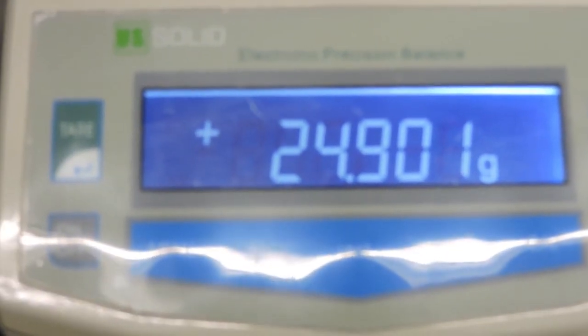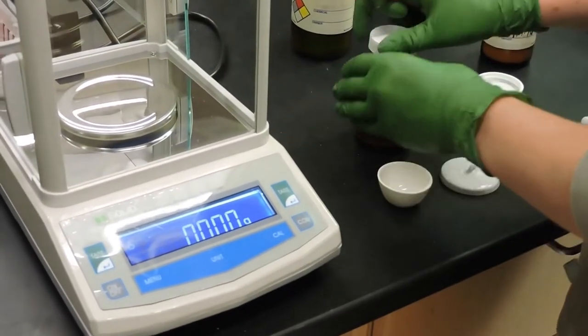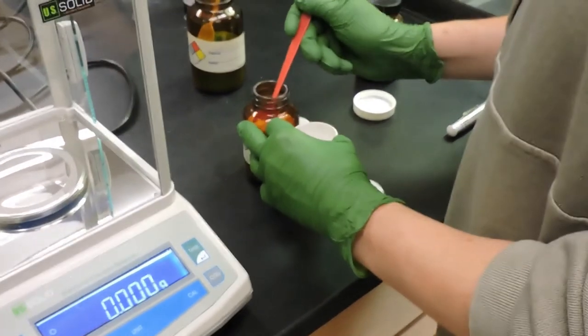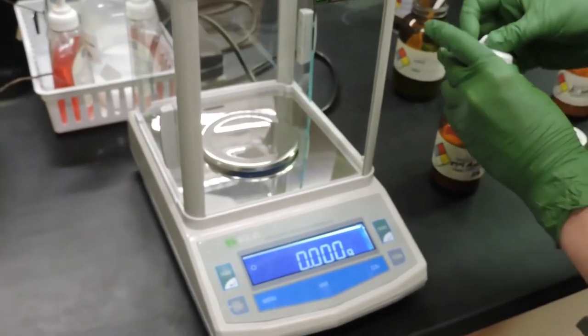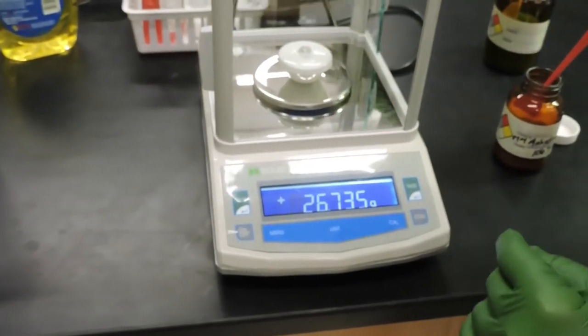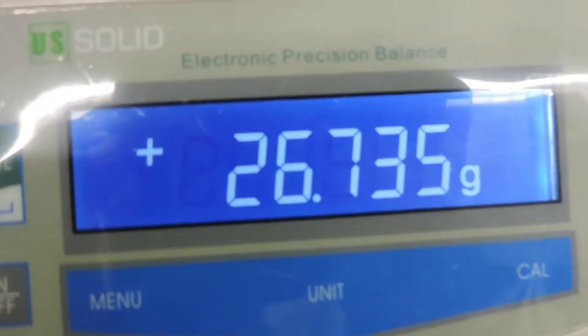This is the mass of the unknown hydrate crucible without the hydrate added yet. It's 24.901 grams. All right. And to this we'll add between 1 and 1.5 grams of our unknown hydrate. The mass of the crucible and lid with the unknown hydrate is 26.735 grams. Again, record these masses in your notebook. We'll record them on the board here for you.